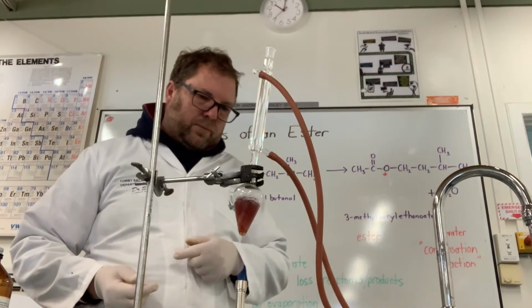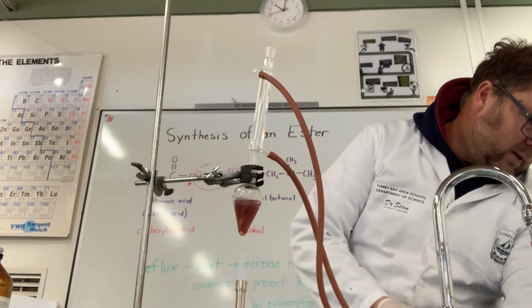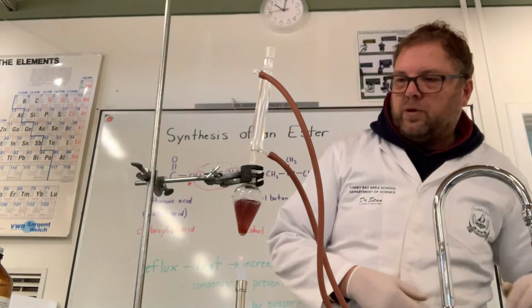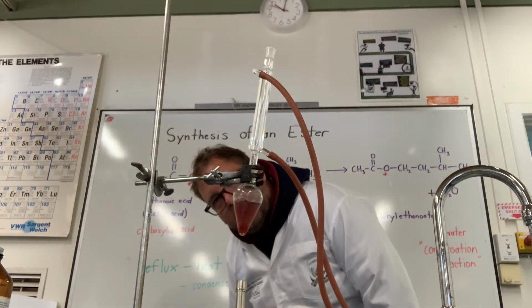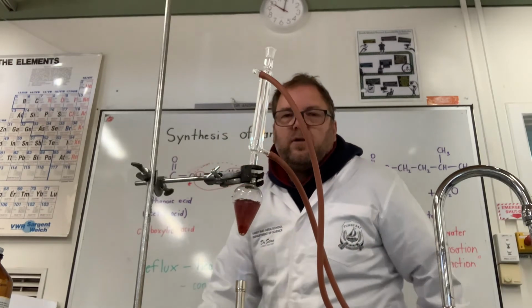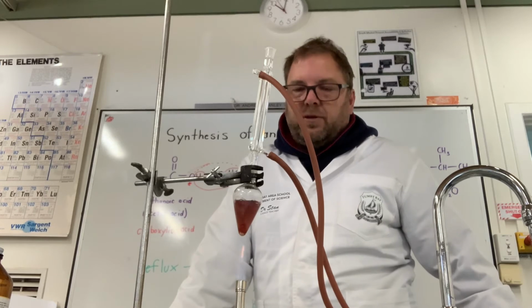It is a bit of a balance. I just want to get that right boil. I don't want it overboiling. Don't want it not boiling as well. Want my water level going about right. I reckon that's pretty good. So I probably need to leave that boil away for between 30 minutes and an hour.